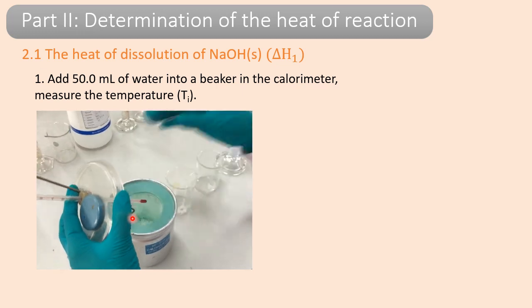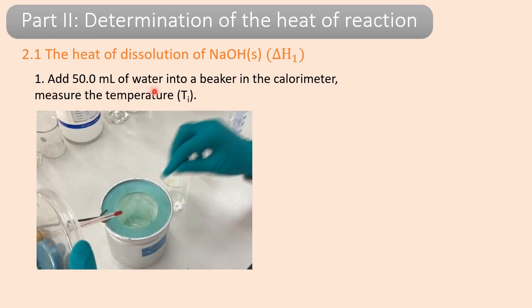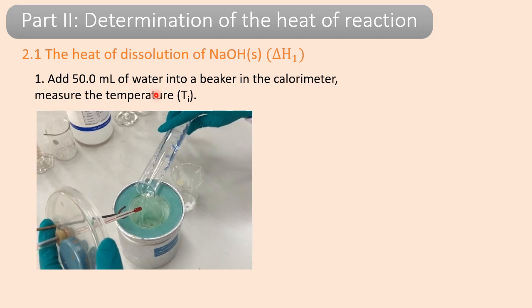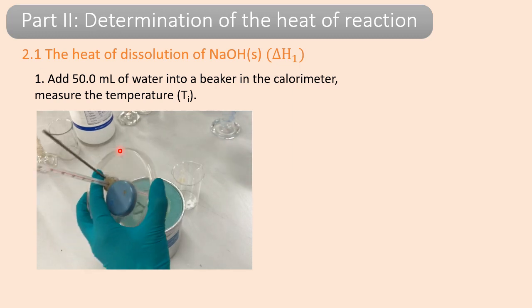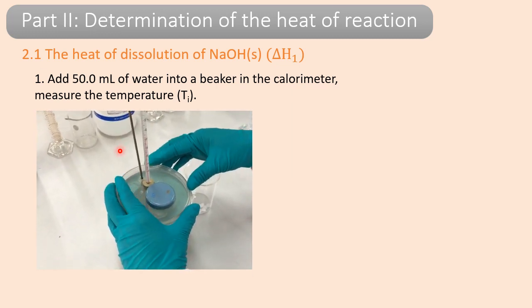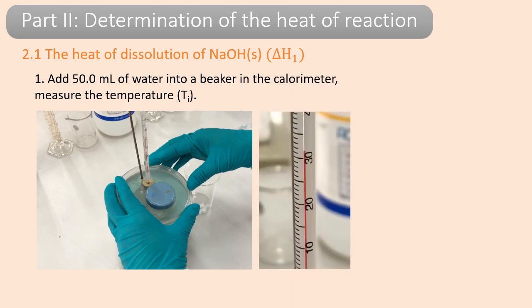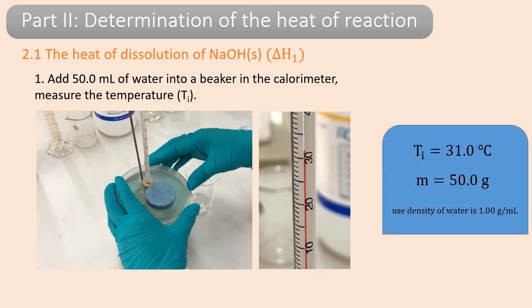We need a calorimeter again. Add 50 milliliters of water into the beaker, then cover it up and record the temperature — this will be your Ti, or initial temperature. We got the result: Ti is 31 degrees Celsius, and the mass of this water is 50 grams.